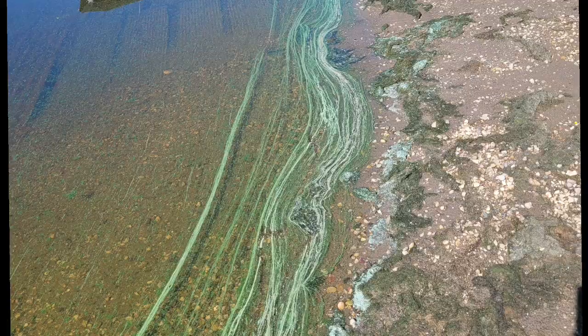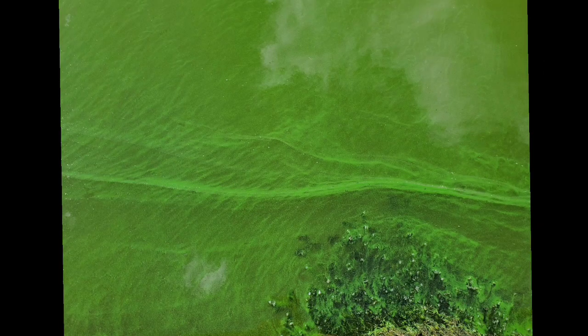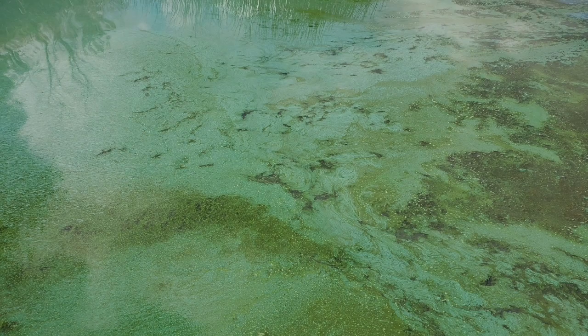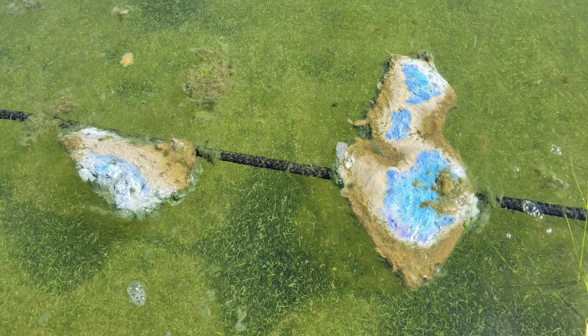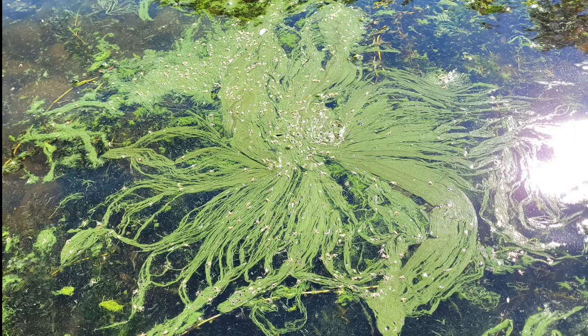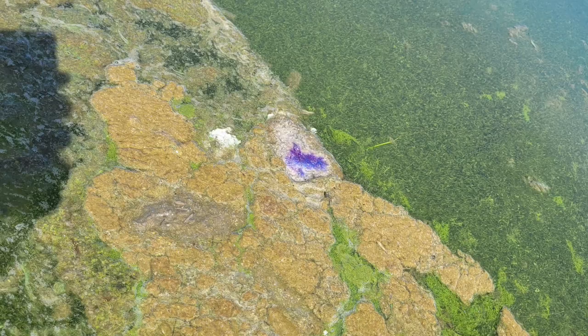These photos show what streaks on the surface of the water may look like. These photos show what scums on the surface of the water might look like. Note the similarity to filamentous green algae. One way to differentiate between green algae and blue-green algae is known as the stick test.